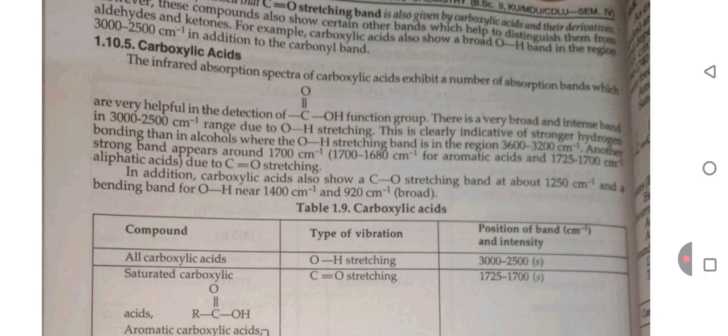Another strong band appears around 1700 cm inverse due to carbon double bond oxygen stretching. In addition, carboxylic acid also shows a carbon-oxygen stretching band at about 1250 cm inverse and a bending band for OH near 1400 cm inverse and 920 cm inverse.